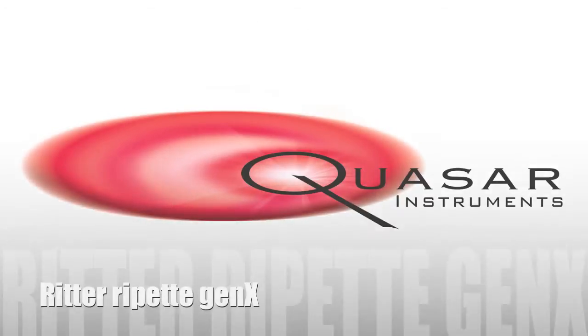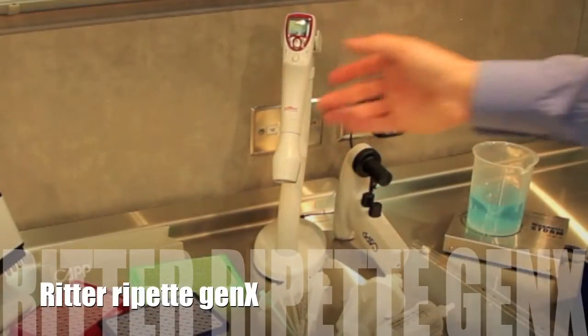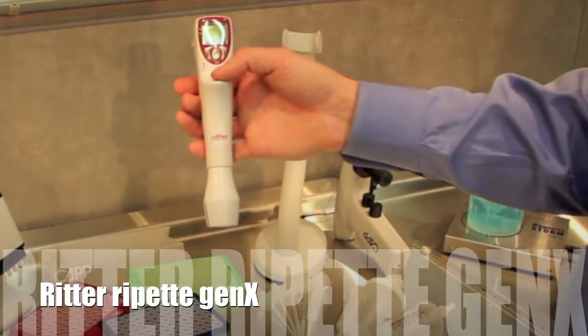In this video we'll be showing you some of the features of the electronic repeater pipette from Ritter, the Ritter Ripette GenX.